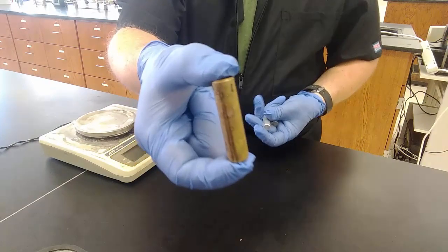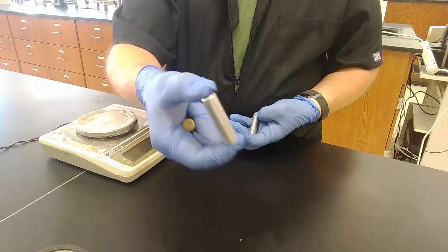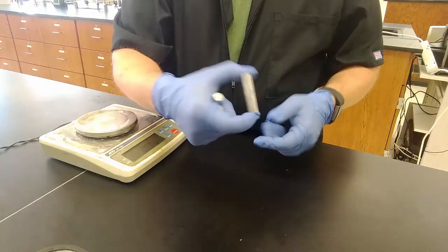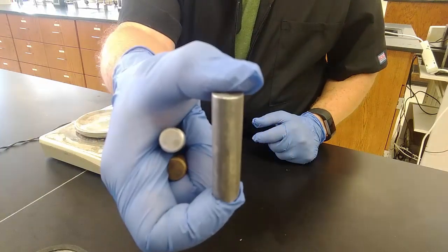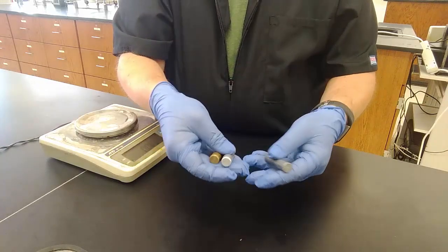You may have a metal bar that looks like this, sort of brownish yellowish. You may have a metal bar that looks like this, sort of shiny and silvery. You may have one that's like this, sort of dull and silvery. Now, your instructor has access to 10 different sets of data. So they'll give you sample data.